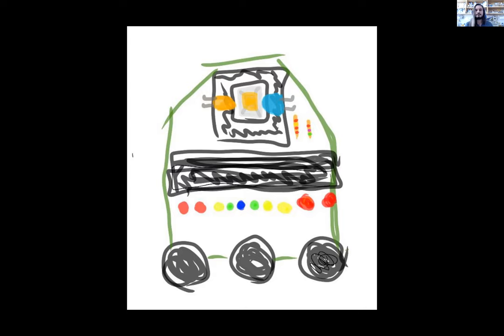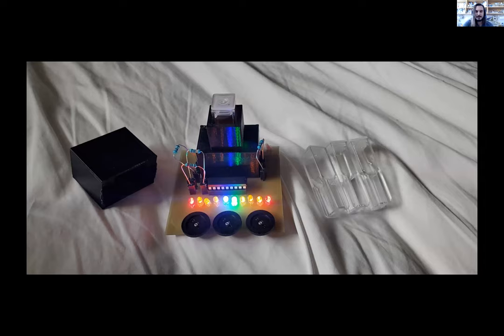Cool. So it's extremely cheap. It's entirely analog. There's no coding, and it cost me less than $1 to assemble the entire structure. I built a super rough prototype where I hand etched this thing. I was using very random through hole resistors, and you have three knobs: the upper range, the lower range, and then your calibration in the center.